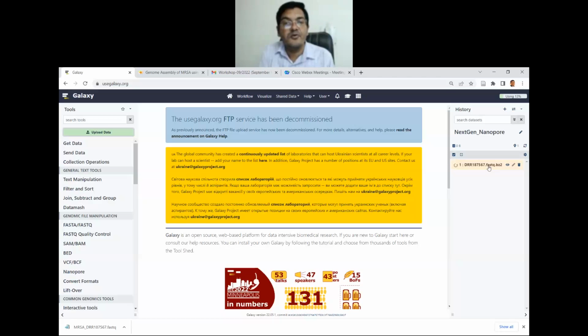But of course, tomorrow we'll not be able to do it side by side, because some of the analysis will take a really long time. I was doing it again for you today. I uploaded my files for NanoPlot and it took almost 5-6 hours, because it was queued up and it didn't go into the actual process for a very long time. So it depends on how busy the server is and how big your data is. It will take a lot of time at each step. And I've already told you that the assembly process is going to be the most time and memory intensive.